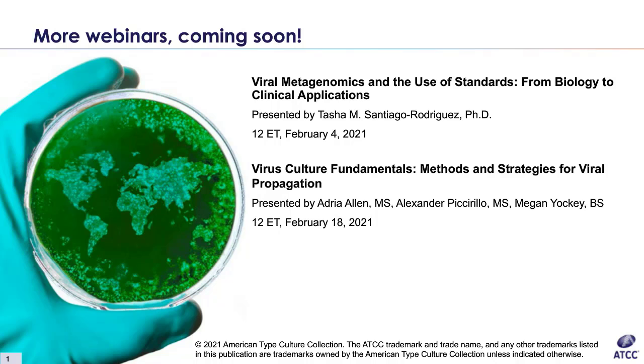Okay, good answer. That leads into this next question that we got here. In all cases, cell culture racks within a nitrogen storage unit, say a dewar, must be above the liquid nitrogen level. So it definitely shows. When you store cells in liquid nitrogen, they are typically advised to be kept in the liquid nitrogen vapor phase, which is the vapor phase directly above the liquid nitrogen.